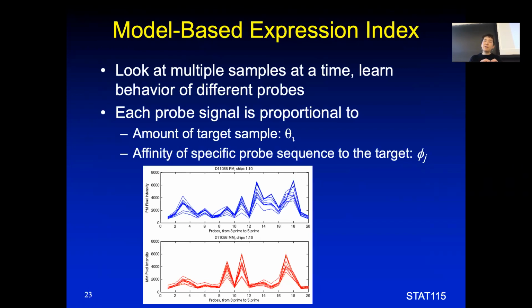Even if the probe value is low, most of the lines preserve their rank, but this perfect match probe still has a lower level than the mismatch probe. Maybe that mismatch probe gets cross-hybridized to some other locations you don't even know. And so RMA decided we're not going to bother with the mismatch probe.